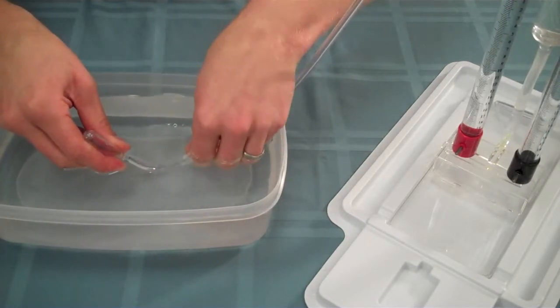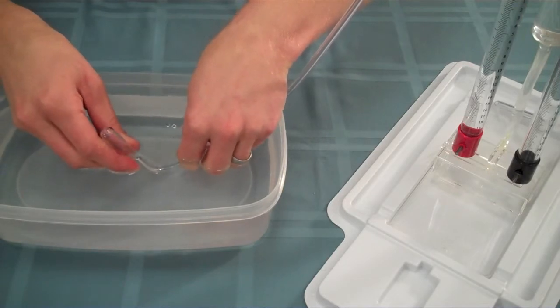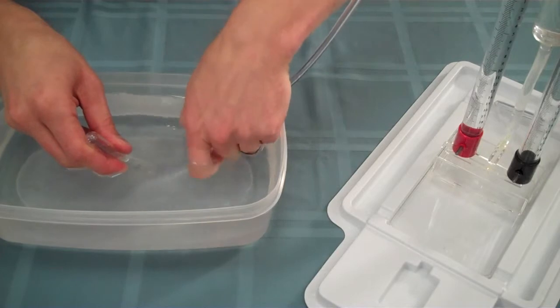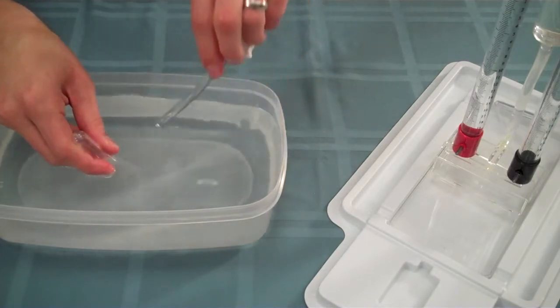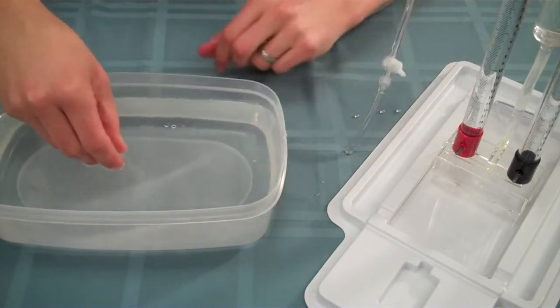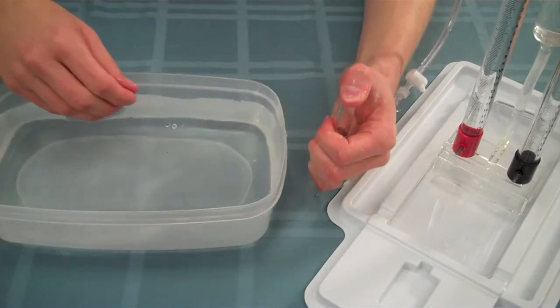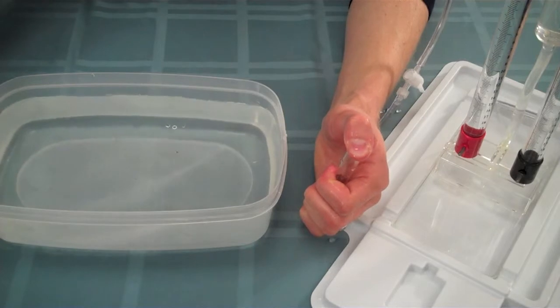Open the valve. You should see the gas displacing the water in the test tube. When most of the gas from the electrolyzer has entered the test tube, remove the tubing from the test tube and place your thumb over the opening of the test tube. Then, remove it from the basin of water and turn the test tube upright.